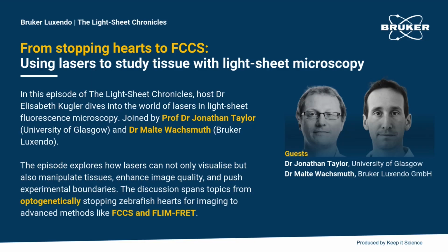Oh, the one thing is really difficult to answer. I think the one thing that I'm most excited about is really the broad range of applications you can address with light sheet microscopy. So we talked about imaging basically on a single molecule level by looking at cross correlations of co-diffusing molecules, at the lifetime of individual molecules that can sense tension via a FRET effect.